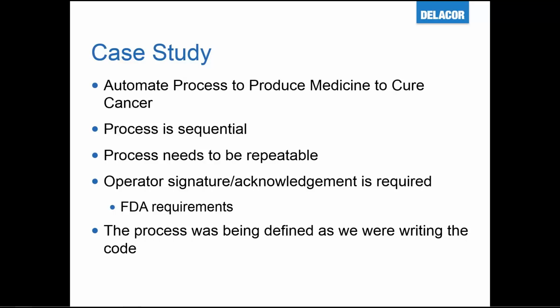This was very hard for me to code in. That meant we have pop-up dialog boxes. And if you've seen any of my other presentations, you know that I hate them. However, here it was an FDA requirement to have some acknowledgement from the operator before going to the next step.